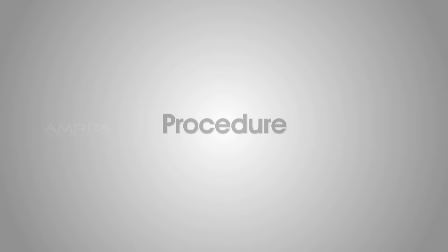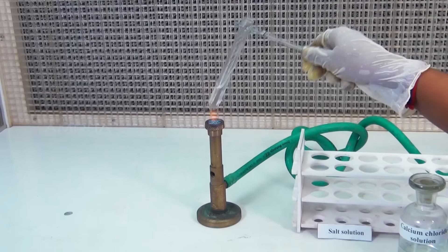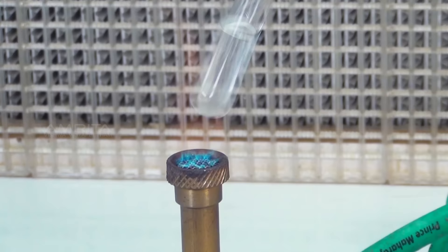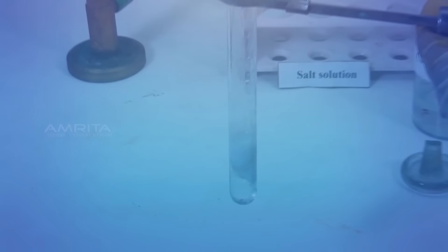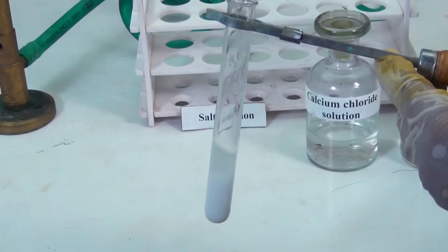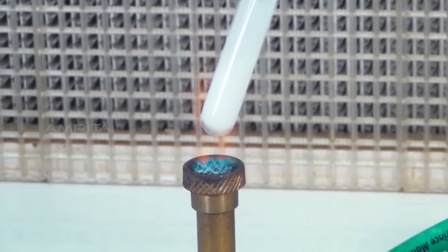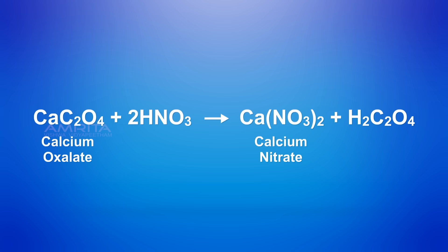Procedure: Take a small amount of aqueous solution of the salt in a test tube. To this, add a small amount of dilute acetic acid using a dropper. Boil the contents of the test tube over the Bunsen burner to boil off carbon dioxide gas. Now add a small amount of calcium chloride solution using another dropper. Oxalate reacts with calcium chloride to form a white precipitate of calcium oxalate. Using a dropper, add dilute nitric acid to the precipitate and warm the test tube over the Bunsen burner. On warming, the precipitate of calcium oxalate dissolves in dilute nitric acid due to the formation of soluble calcium nitrate.